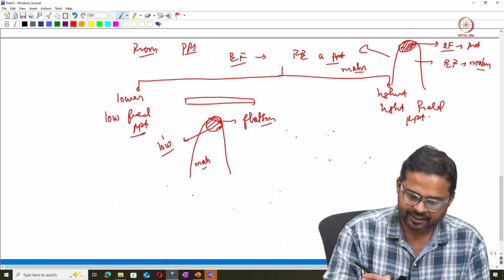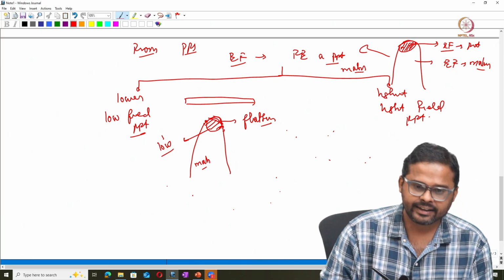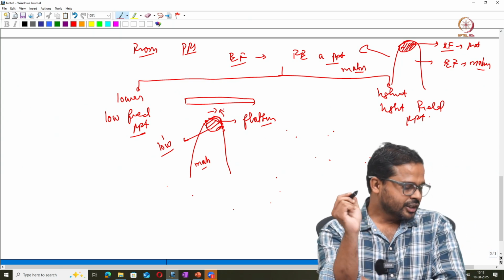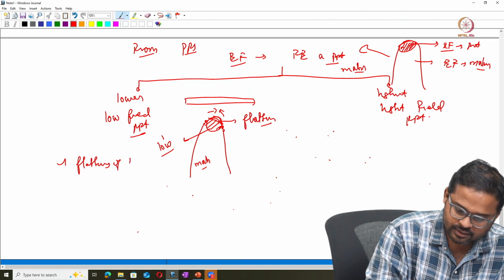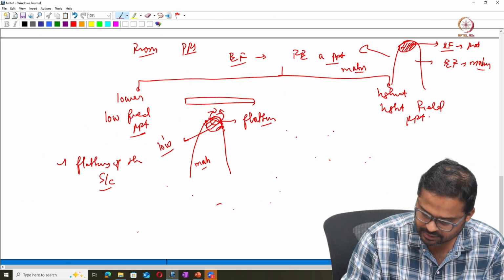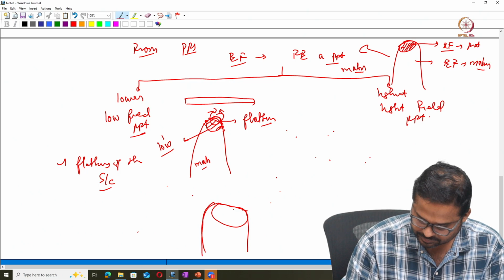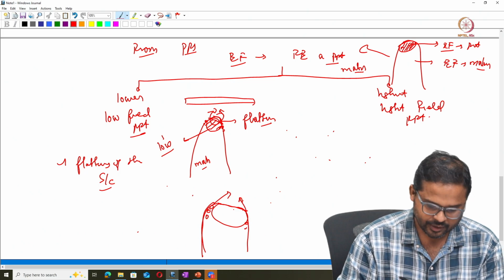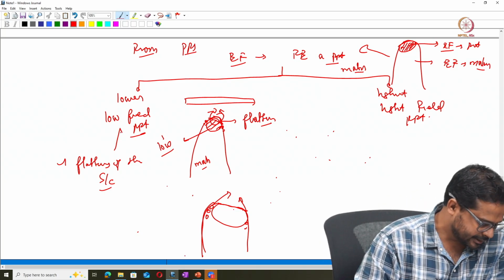Due to this flattening, the atoms from the matrix get deflected inwards. So this causes a flattening of the surface of the needle specimen. If you zoom out, you will have a precipitate which gets flattened on the needle specimen, and the atoms near the surface will get deflected inwards in the case of low field precipitates.